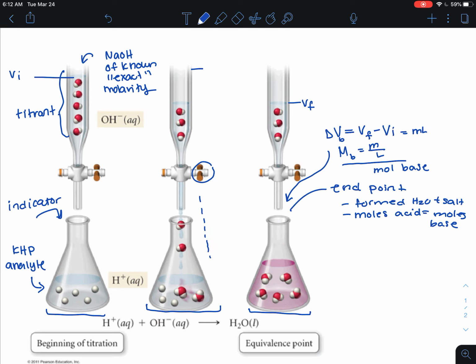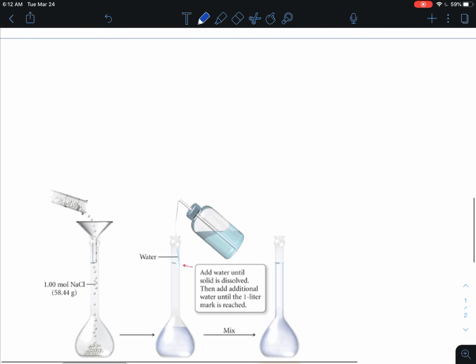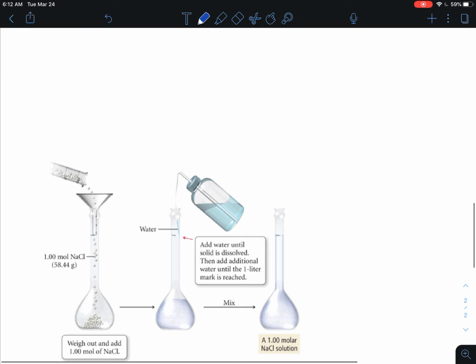Now, just a little bit, I'm going to talk about the different days of the experiment since we actually physically can't go and do it. But the experiment is set up in 3 different parts, and there are some important conceptual parts as to why that I wanted to talk to you about today. So day 1 of the experiment is actually to make KHP known.